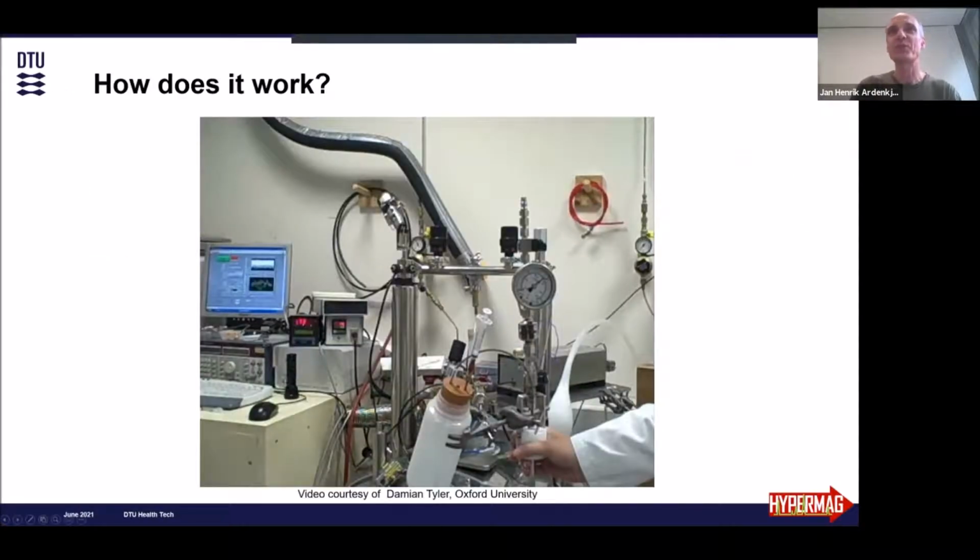Now I just want to illustrate... okay, sorry, this will not run this video. Okay, anyway, I will quickly skip this because many of you have probably seen it, but this is the most exciting illustration of the dissolution DNP experiment. This is a video from Oxford University that I often use because it shows a very manual procedure of hyperpolarizing a DNP sample.